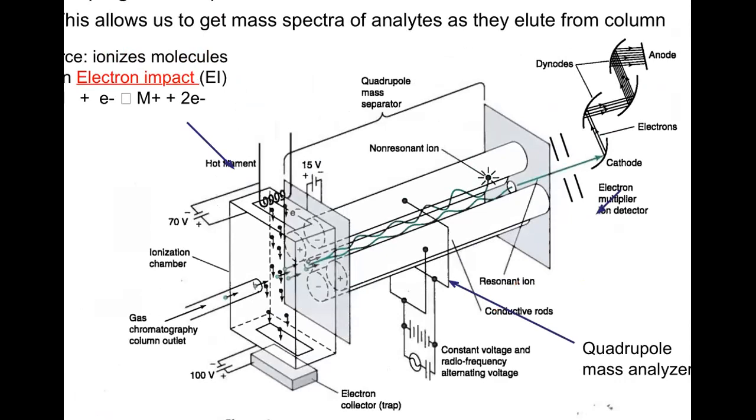It can measure lots of different masses, usually up to a few hundred AMU. And the reason why is because if we want a different mass to make it through that hole, all I need to do is adjust the DC and AC waveform combination. And if I fine tune that a little bit, I can make a different mass make it through the hole, heavier or lighter, depending on how I adjust the DC. So what these quadrupole mass analyzers basically do is they scan or change the DC and AC waveform to get the complete mass spectrum. What I mean by that is they scan from low masses allowed through the hole up to higher masses allowed through the hole. And as a result, we can measure all the masses in a complete scan.